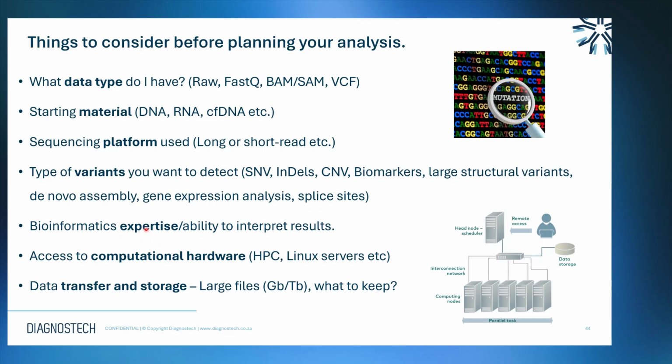If you're running any of these pipelines locally, you need to understand your access to what computational hardware is available, things like Linux servers for running specific pipelines that require Linux, or high performance clusters or computing that's required for large data sets, things like single cell analyses, where we're dealing with huge amounts of data that can't typically run on your laptop or basic PC.